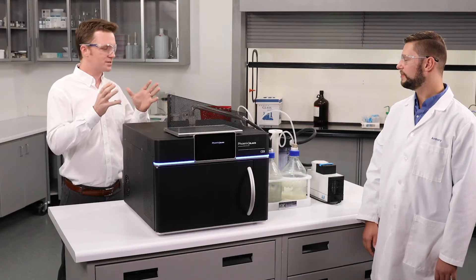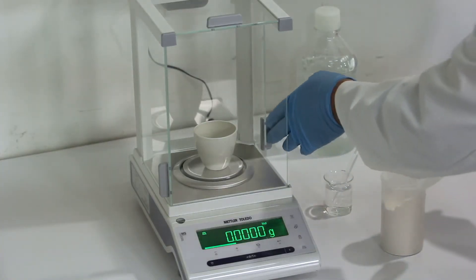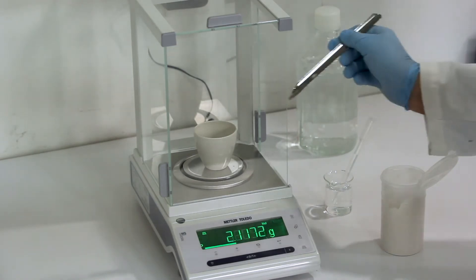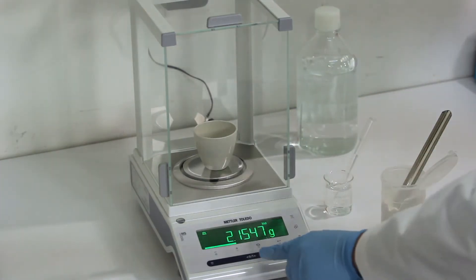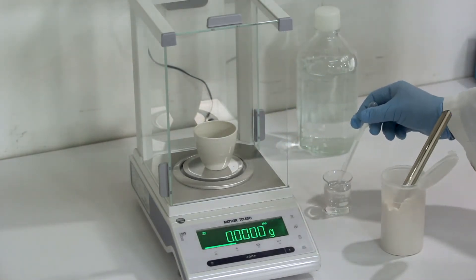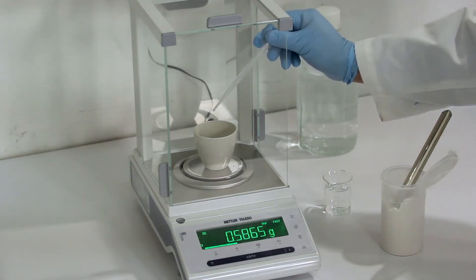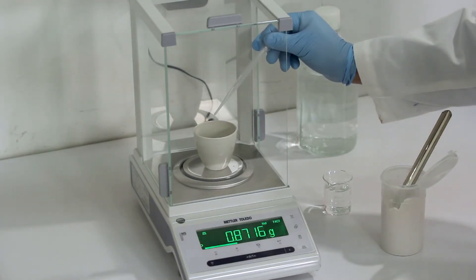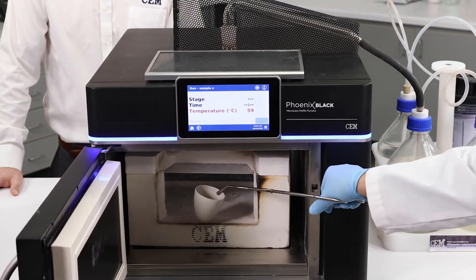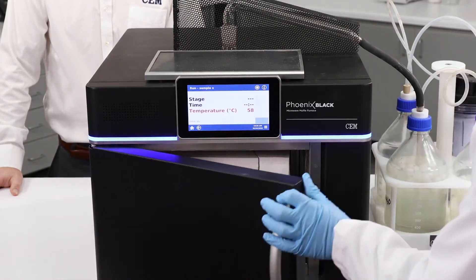To run a sample on the Phoenix Black sulfated ash system, first you want to take your pre-ash crucible and weigh a designated amount of sample into it, then you want to add just a little bit of acid to wet the sample. After you've added your acid you can input the sample into the Phoenix Black, close the door, and hit start.